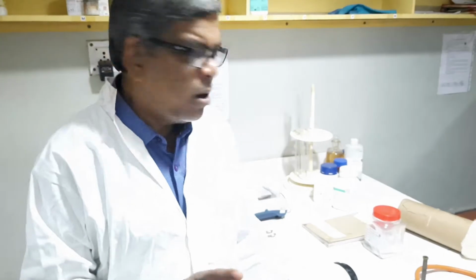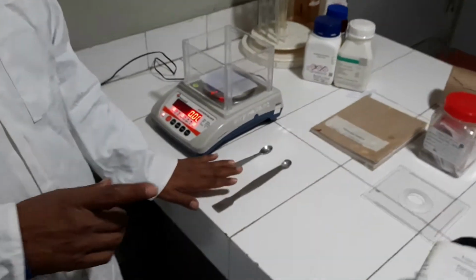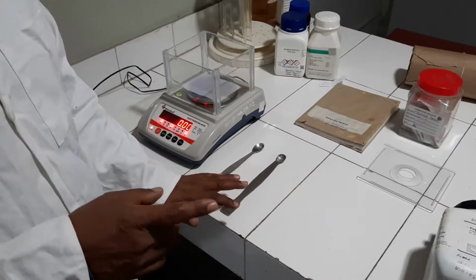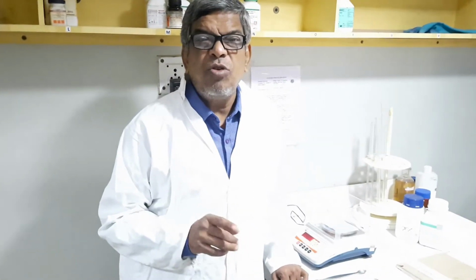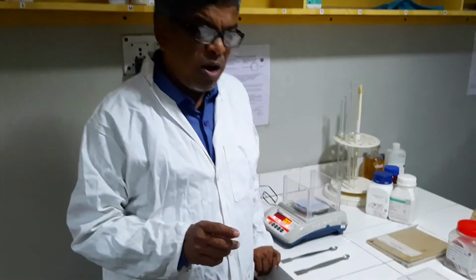But keep in mind, we will have to use a different spatula. We cannot contaminate one media with another. For working in microbiology, you will have to keep in mind that please do not contaminate. You will have to be very firm about it, right?